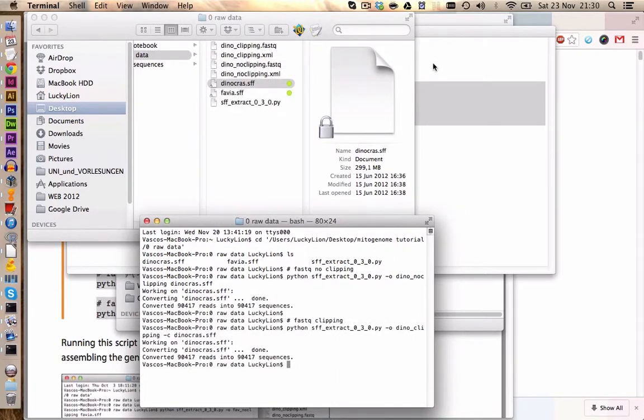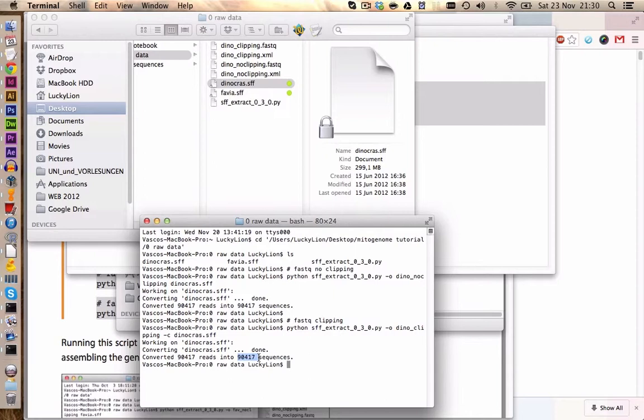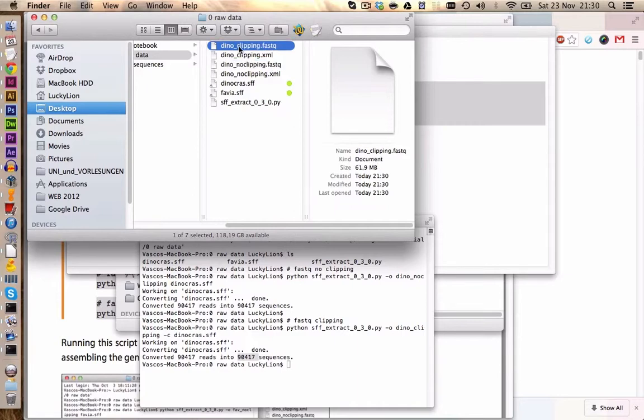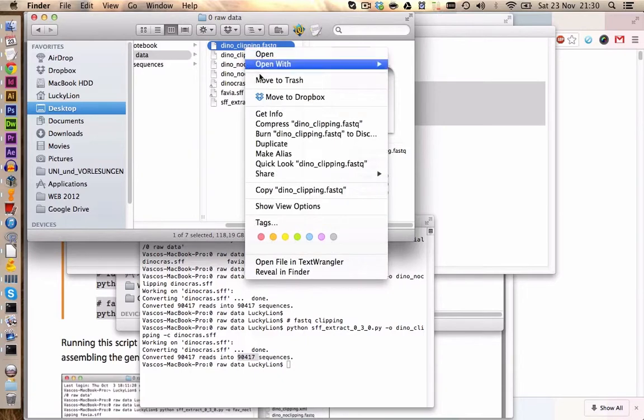Alright now it is done converting all the sequences and we also did get the first information about our data set. We have roughly 90,000 sequences in the 454 data. We have created now a clipped version and one with no clipping. This is just to take a look at it how the data looks when it is not clipped. But I will provide you with the Dinocross data which is clipped.